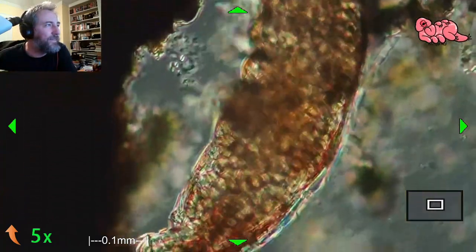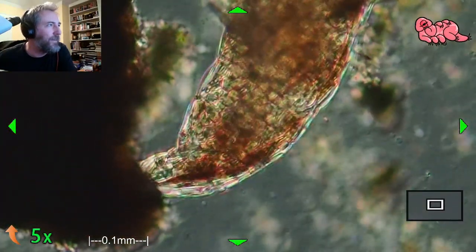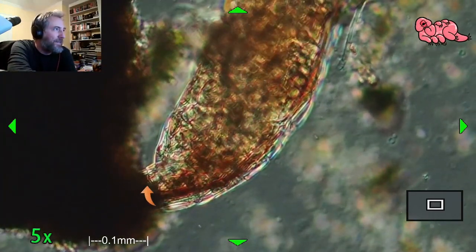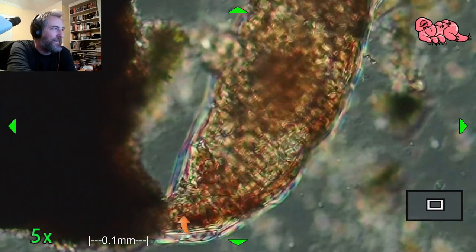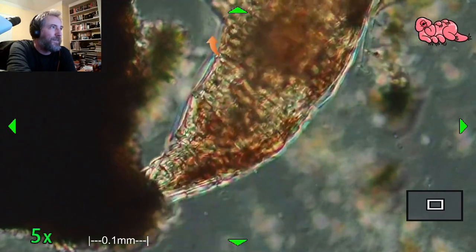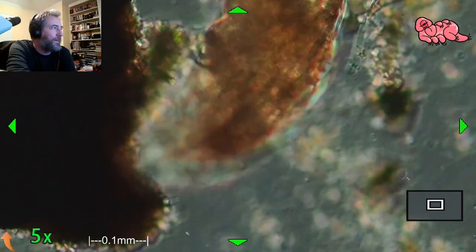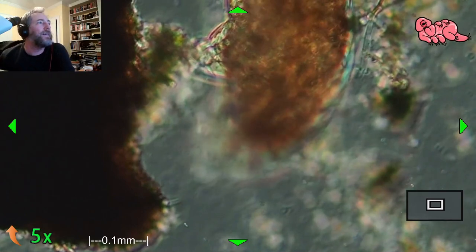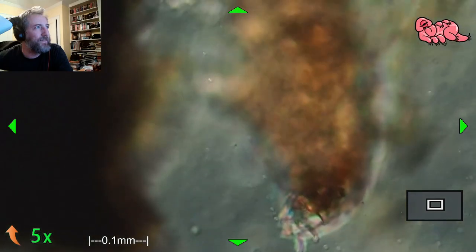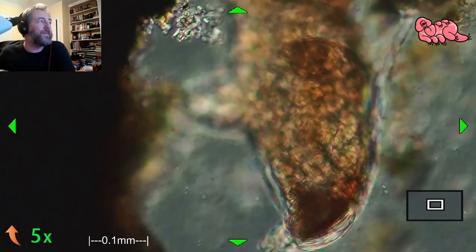And the back legs, as I mentioned, are kind of paired and a little bit like a scallop. And you can kind of see them here. And they're kind of reversed. In other words, they only flex under her body. They only flex this way. Whereas these ones are kind of independent legs. This one's kind of paired together. And their little claws on the back end are for grasping things, to hold the water bear in place more or less. And then kind of like a scallop, the legs only fold under the body.